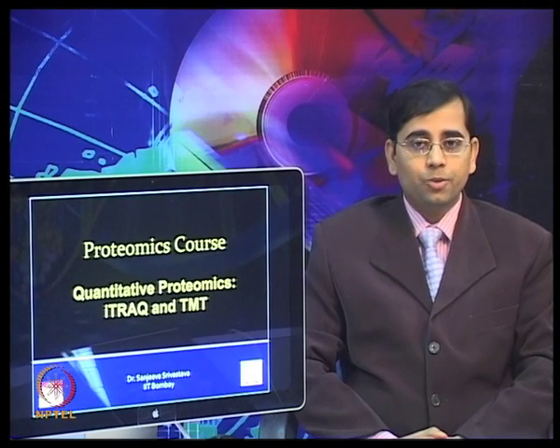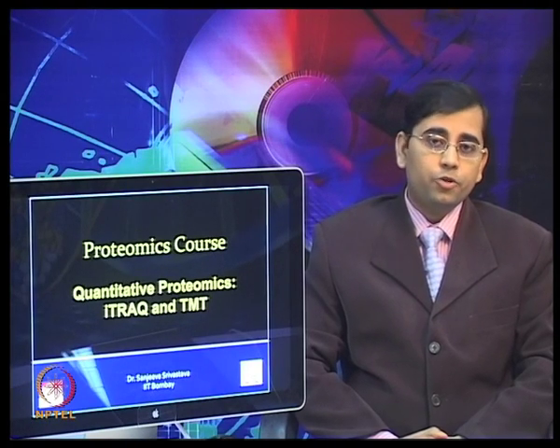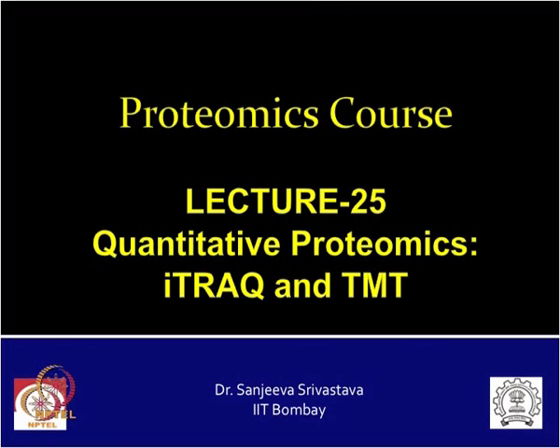Welcome to the Proteomics course. Today we will talk about quantitative proteomics and discuss iTRAQ and TMT techniques.